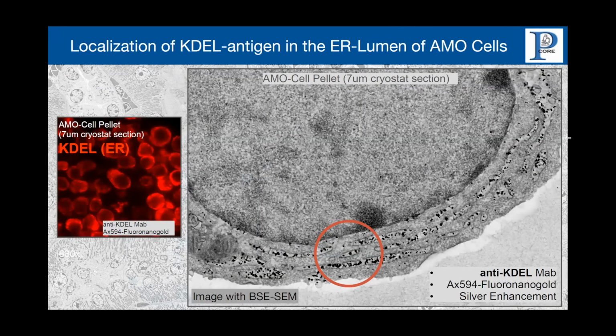I know that imaging of the section was really a great advantage. So my question is, when you use the carbon-coated glass slides, can you use just regular glass slides and coat them yourself, or do you have to buy special, very flat commercial glass slides? Very nice question. No, we prepare all our glass slides ourselves.